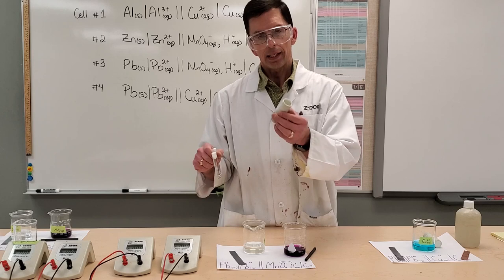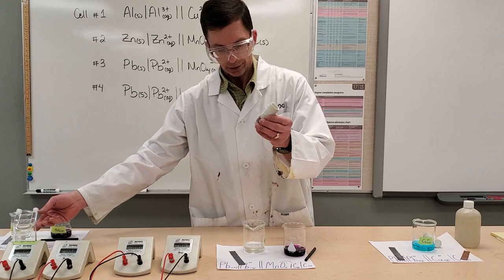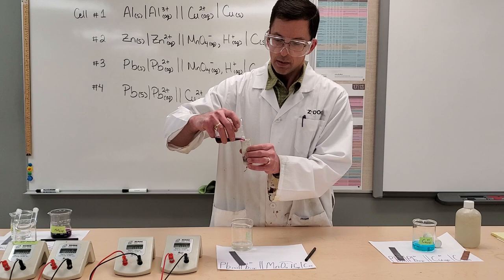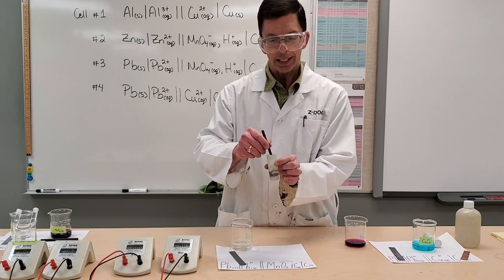So an alternate design to the salt bridge is the porous cup. And it's going to allow for ion migration. This is a one beaker design, pouring some permanganate ions into the porous cup. And to complete this half cell, I put my inert electrode, my carbon electrode, into the porous cup containing permanganate ions.